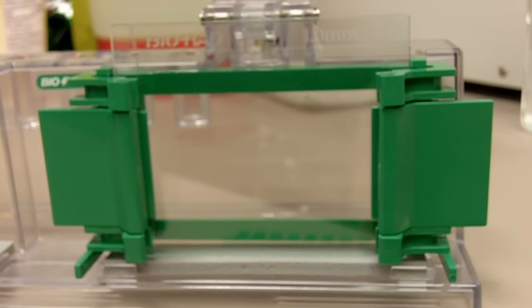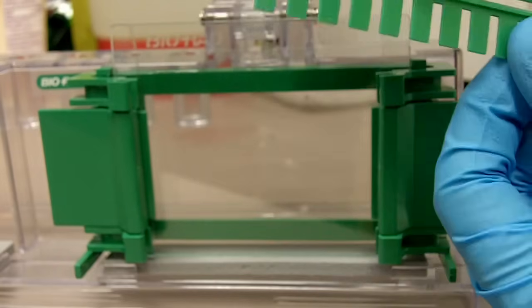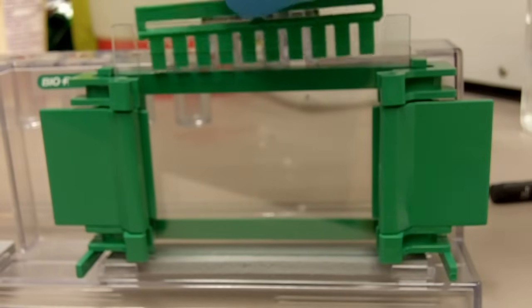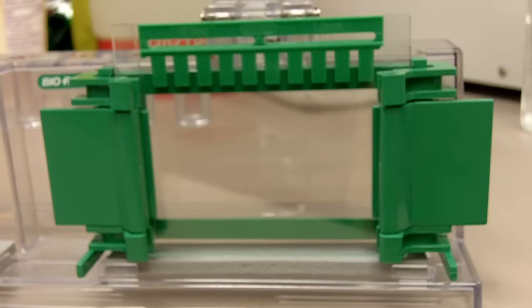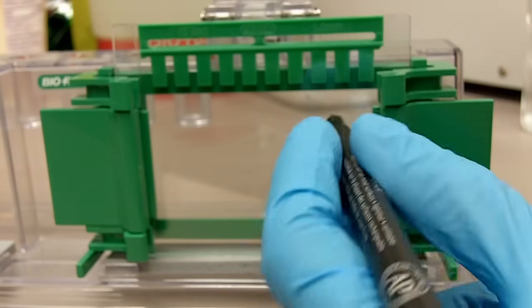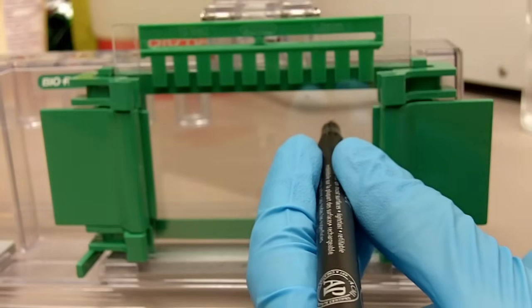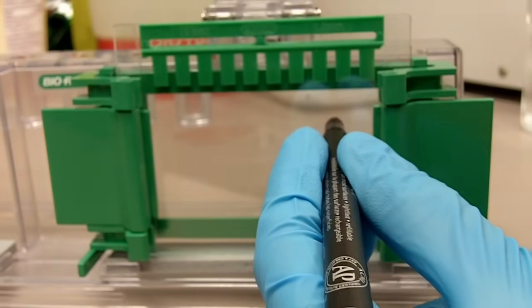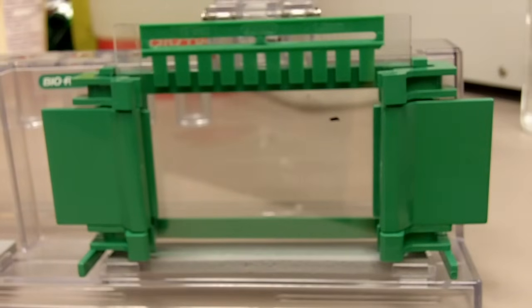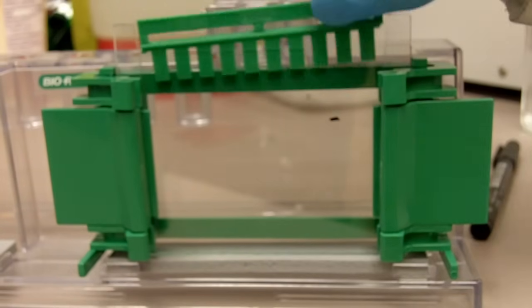After we have assembled the gel apparatus, what we need to do right now is we will take the comb and place it in between the glass plates like that. We'll take a marker and make a mark approximately one centimeter below the comb right there. We'll take the comb out.